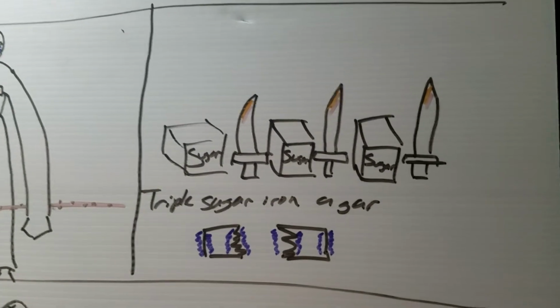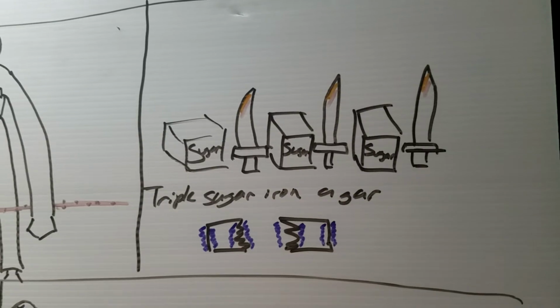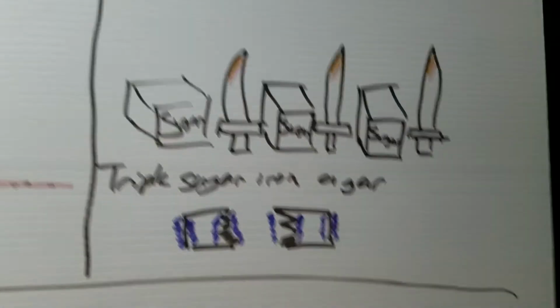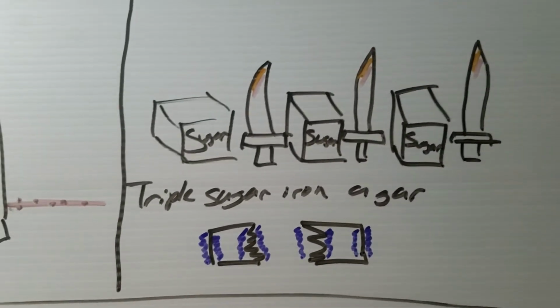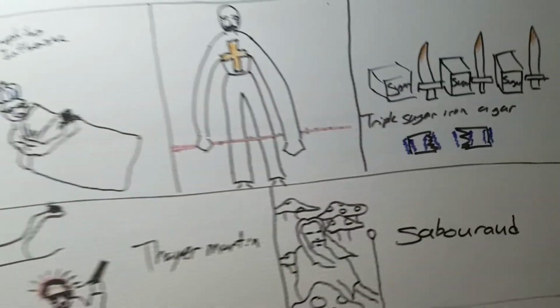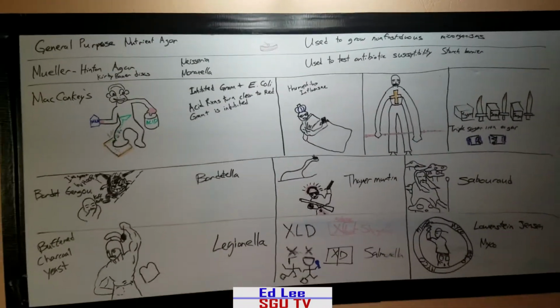So you can see here's the graham crackers again, but they've gone bad, and they're all broken up. Before we could see here was a complete graham cracker, right? These guys each had a complete graham cracker on them, right? The XLD guys. But this one over here, the graham cracker's been fractured, and it's all old and purpley looking. So this is really a test for gram-negative bacteria. And there you go. You have hopefully an easy picmonic / sketchy way of memorizing all this information.